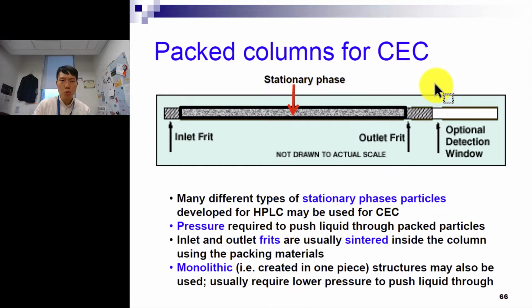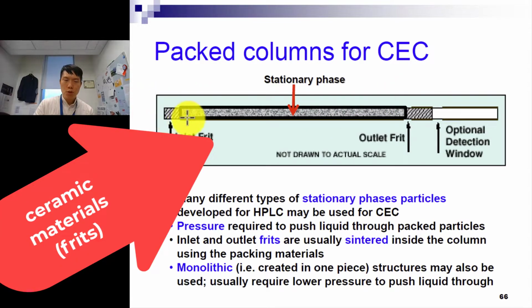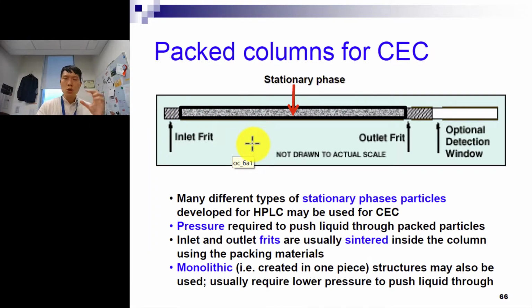Now we have come to this part called the packed column for the CEC. There are actually many types of stationary phase particles developed for HPLC that we can also use for capillary electrochromatography here. So there are some kind of frits, which is a kind of ceramic material that we put inside there, to interact and to block it. Therefore, it's not really like a vacuum, like an empty space. So there's need for some kind of pressure to push the liquid through this kind of packed particles there.